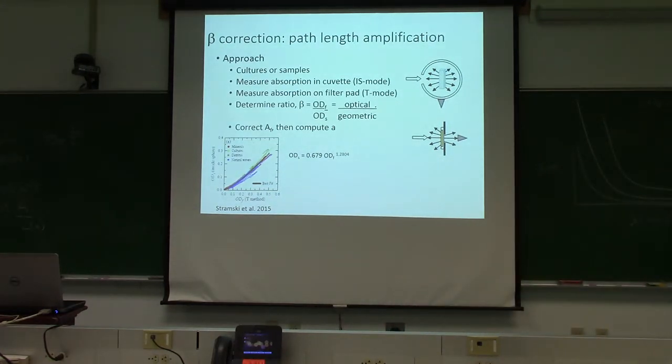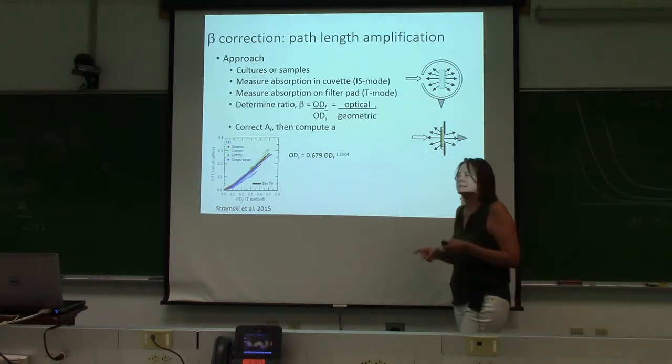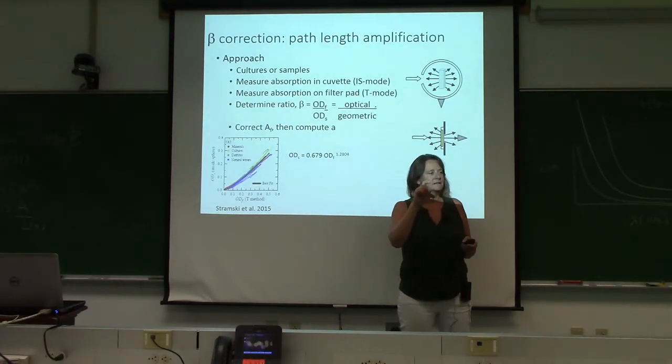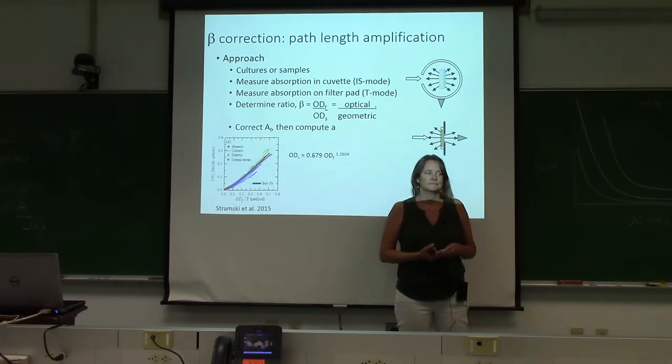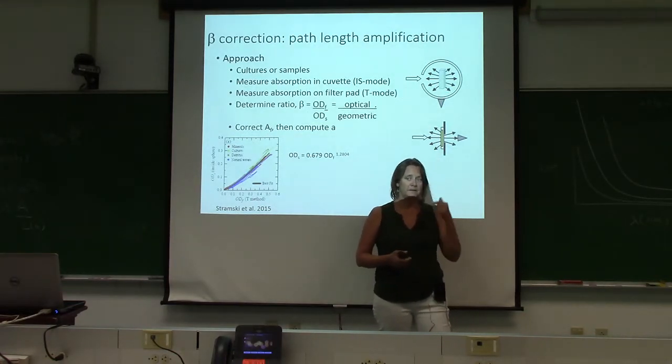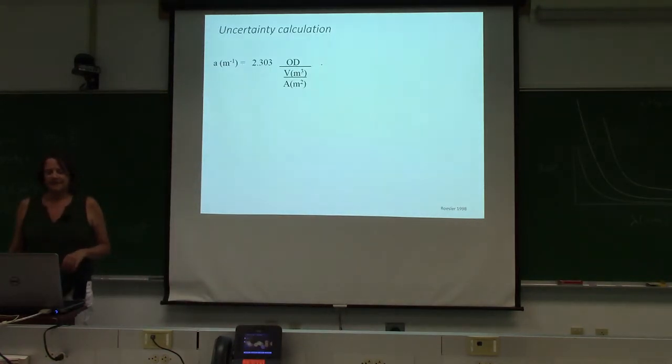So phytoplankton don't absorb in the infrared, but non-algal particles appear to. Even if you keep them within the same optical thickness, you always see some near-infrared signal in the integrating sphere that you don't see with phytoplankton. So put that in your thinking cap.